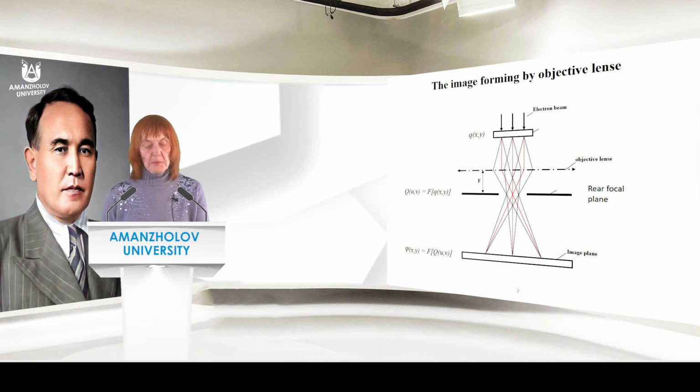Nowadays, a number of researchers describe both magnetic domain structure studies and methodical reports on electron microscope adaptation for transmission electron microscopy.